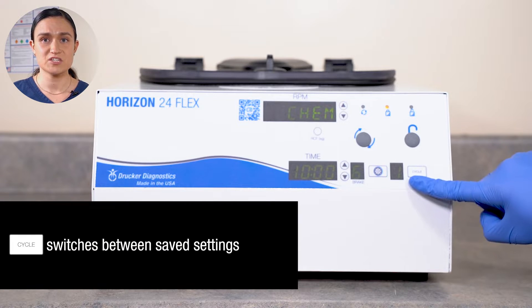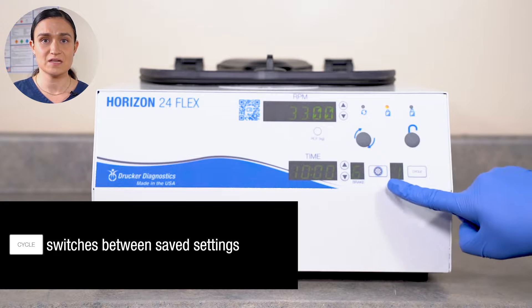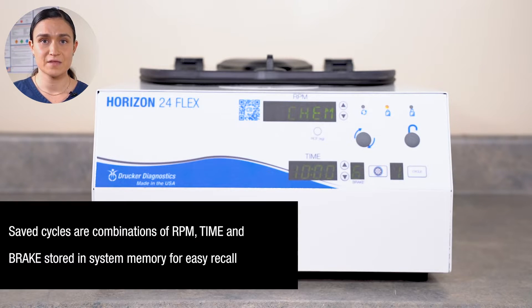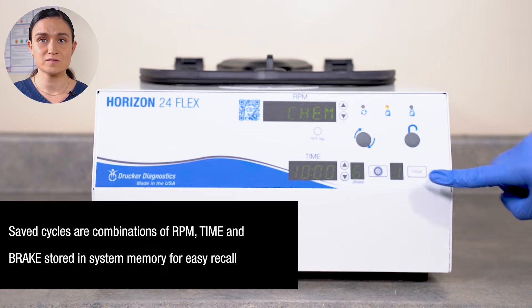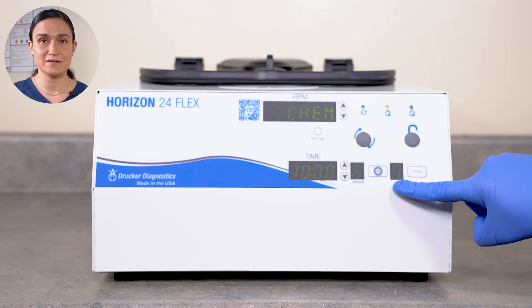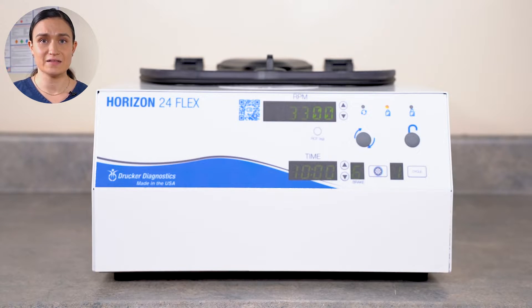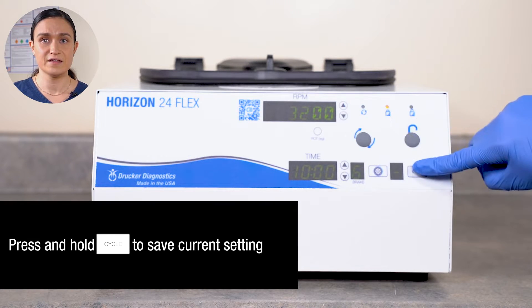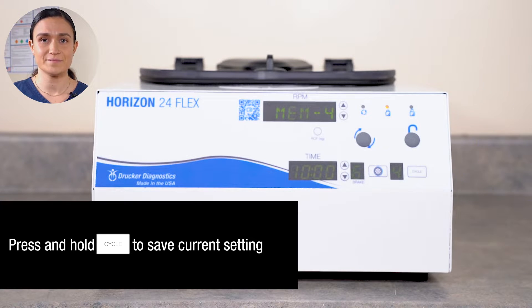The Cycle button switches between saved settings, and the display next to it shows the number of the currently selected cycle. A dash means you have no saved cycle selected. Your Horizon 24-Flex can save up to 10 cycles. A saved cycle is a combination of RPM, time, and brake settings stored in system memory for easy recall later. The system will automatically assign each one a number, visible in the window next to the Cycle button, and automatically name the cycle — Mem4 for the first one, Mem5 for the second, and so on. We can create a new saved cycle by adjusting our centrifuge as desired and then pressing and holding the Cycle button. And those are your controls.